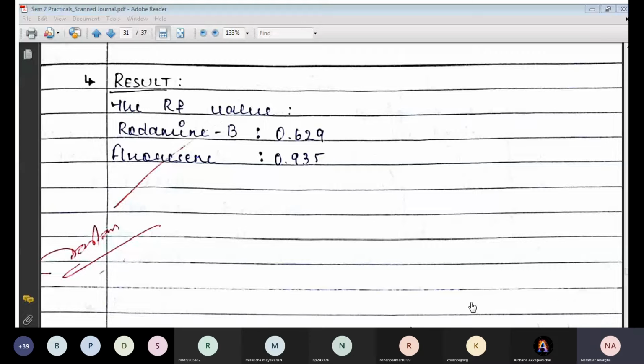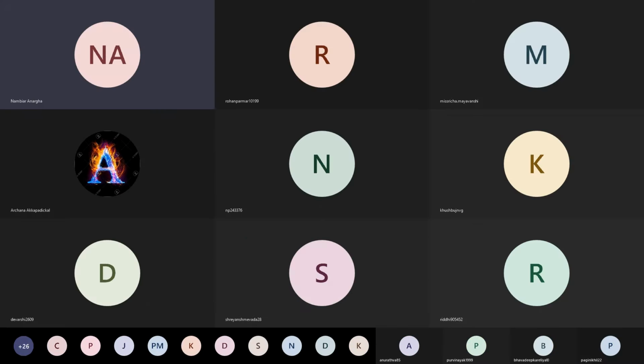In this case we are taking acetone and water. You know every solvent vaporizes, it evaporates after a certain period, and its vapor is always present. So when we take our mobile phase into our chamber, if we don't close it, the solvent, whatever mobile phase we take, continuously vaporizes, because we have some room temperature also, so it continuously vaporizes.